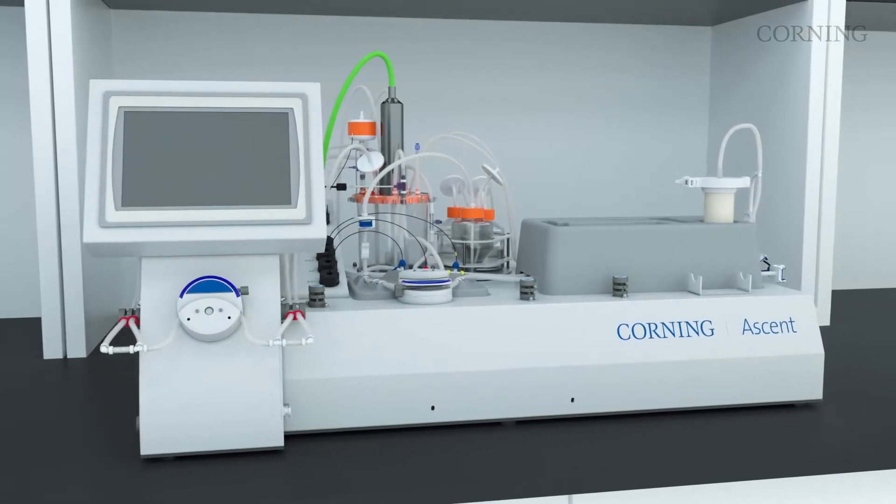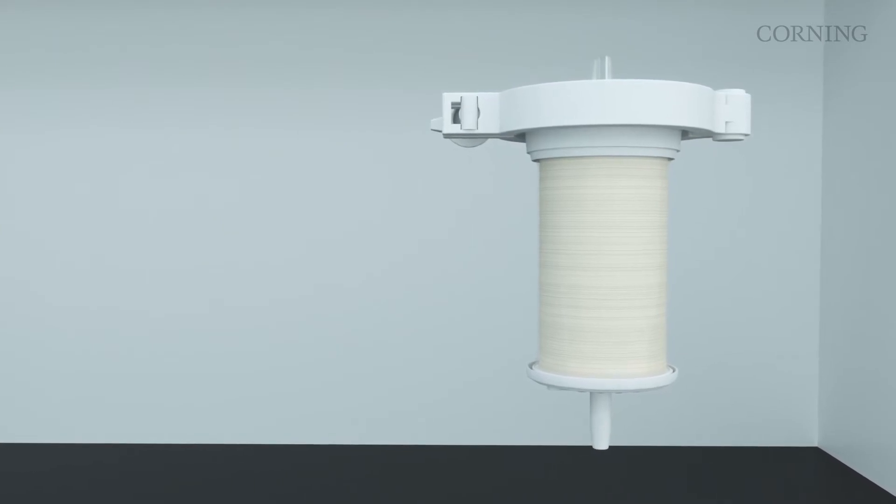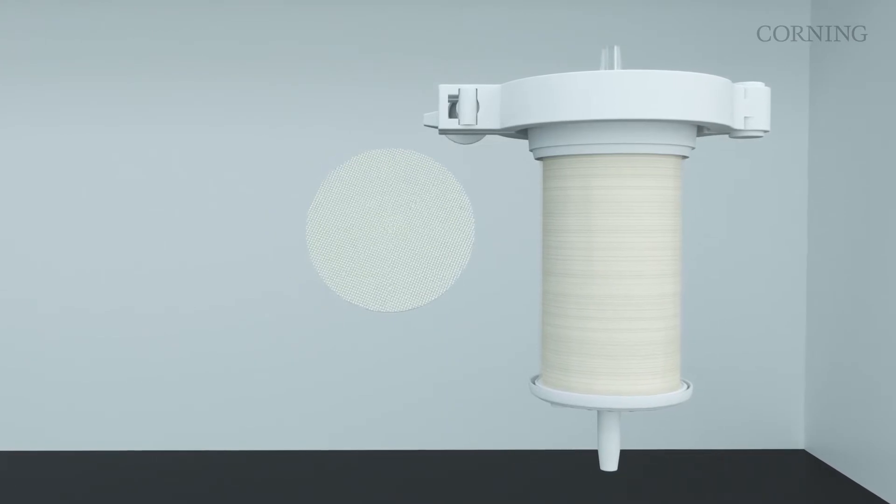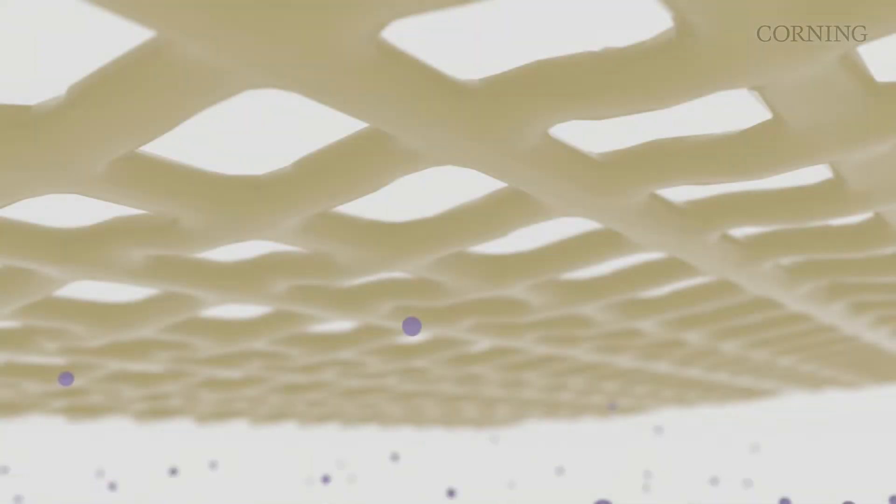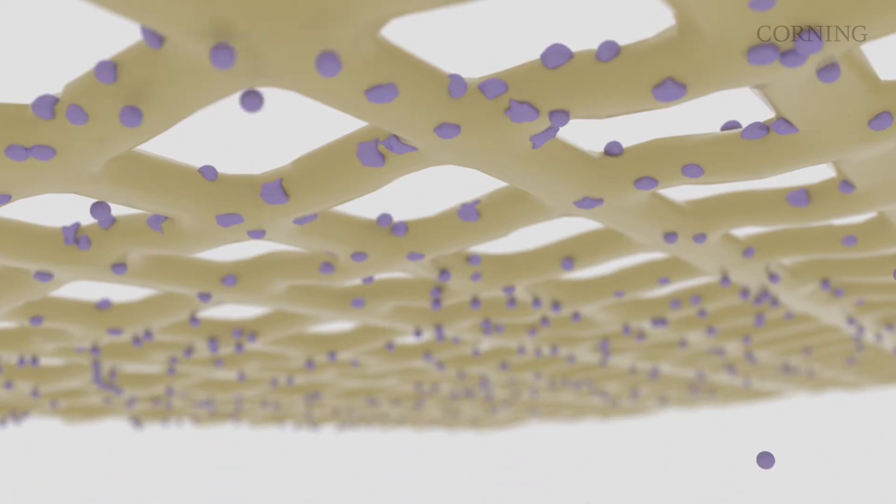The bioreactor vessel is designed for optimal fluid dynamics, providing efficient nutrient delivery and waste removal. Its specially treated woven polymer mesh substrate is designed to maximize cell growth throughout the bioreactor bed with consistent media exposure.